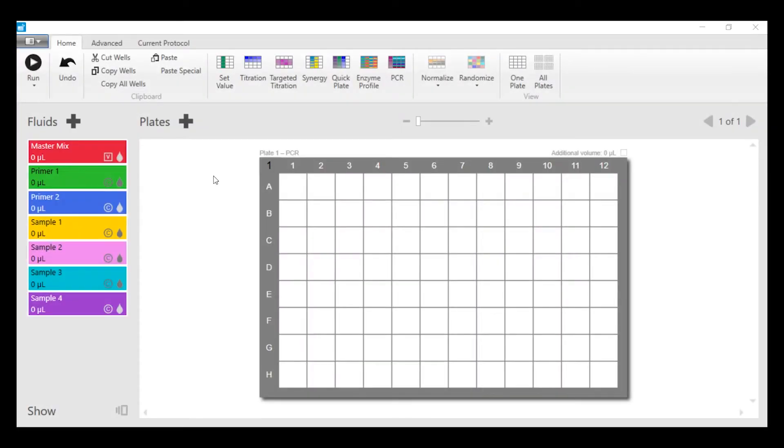In this video we're going to show you how to automatically set up a qPCR plate using the PCR wizard in your digital dispenser software.